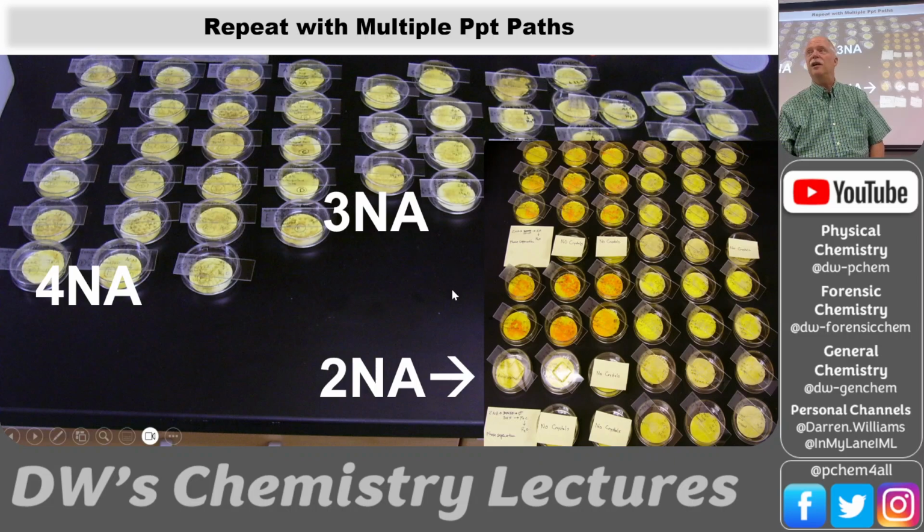They did all of those samples with the 4-nitroaniline, the 3-nitroaniline, the 2-nitroaniline. And then we started looking under the microscope to see what the particle sizes look like, and we see all the microscope slides there.